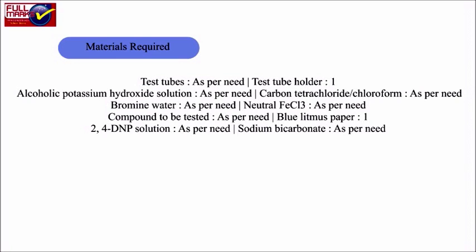Materials required: test tubes, test tube holder, alcoholic potassium hydroxide solution, carbon tetrachloride or chloroform, bromine water, neutral FeCl3, compound to be tested, blue litmus paper, 2,4 DNP solution, sodium bicarbonate.